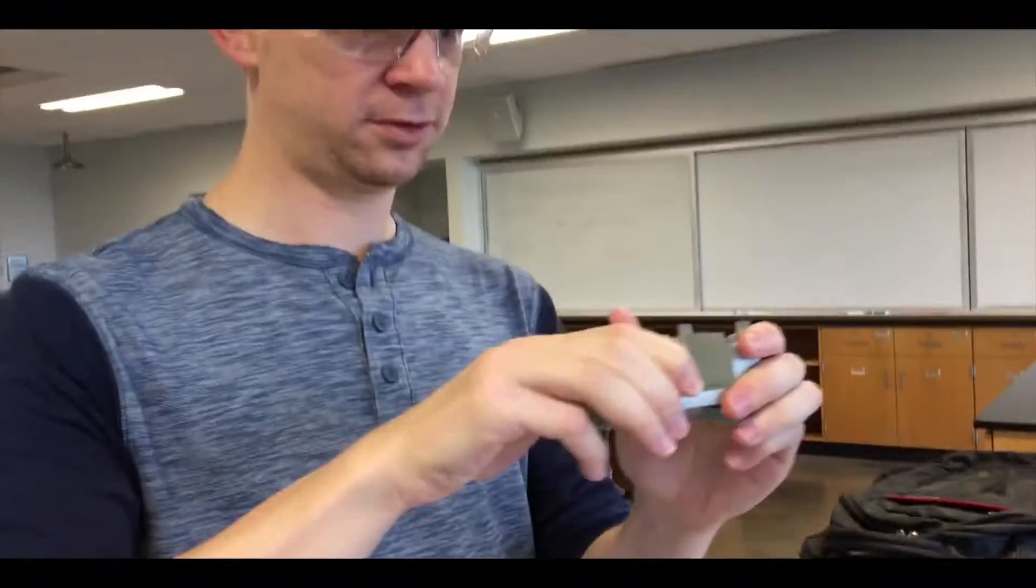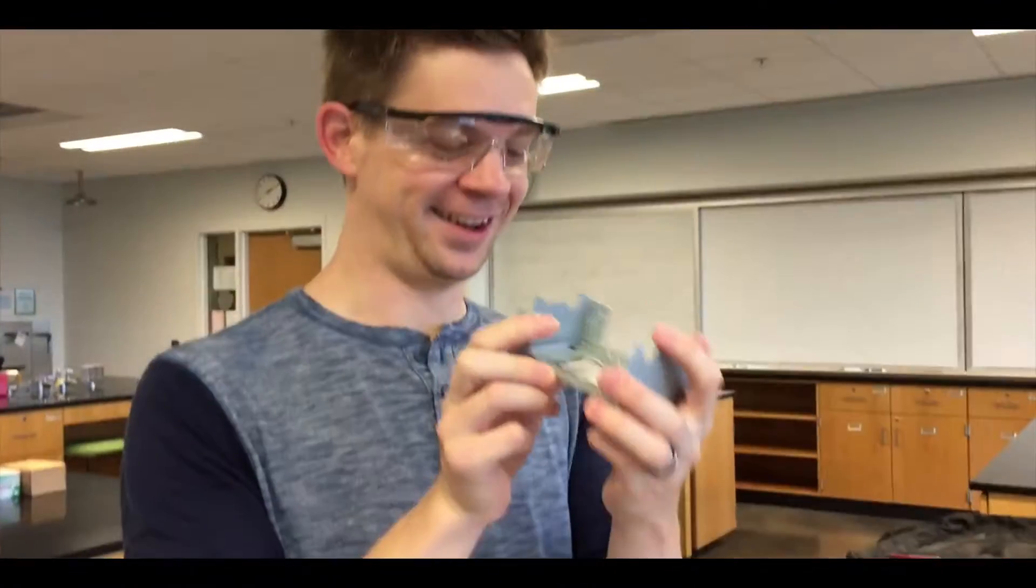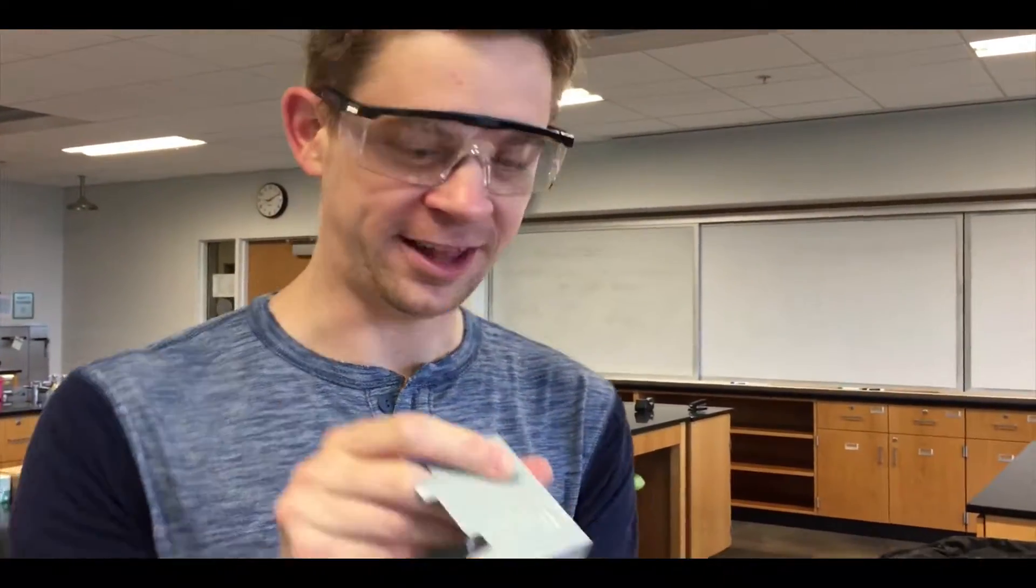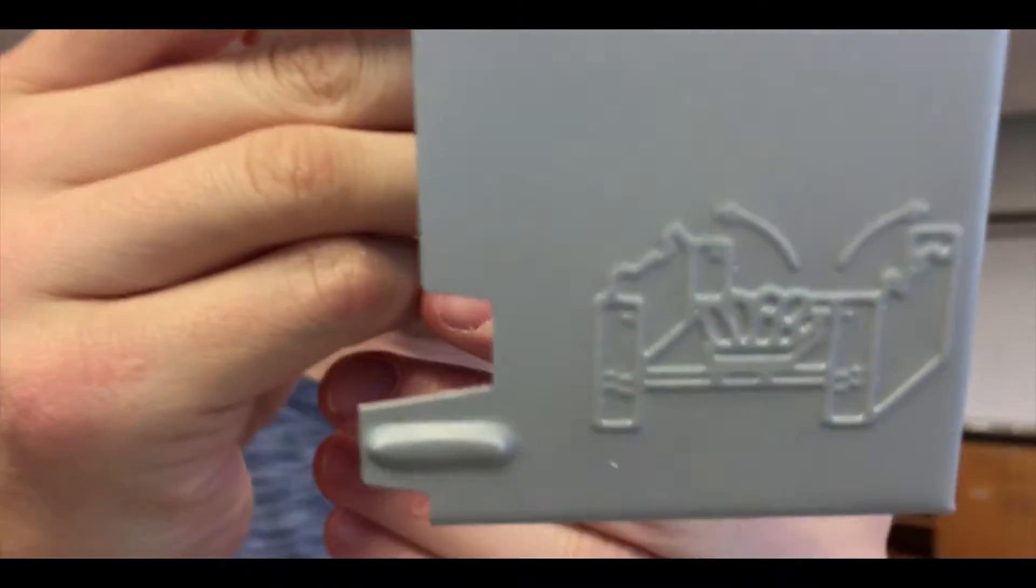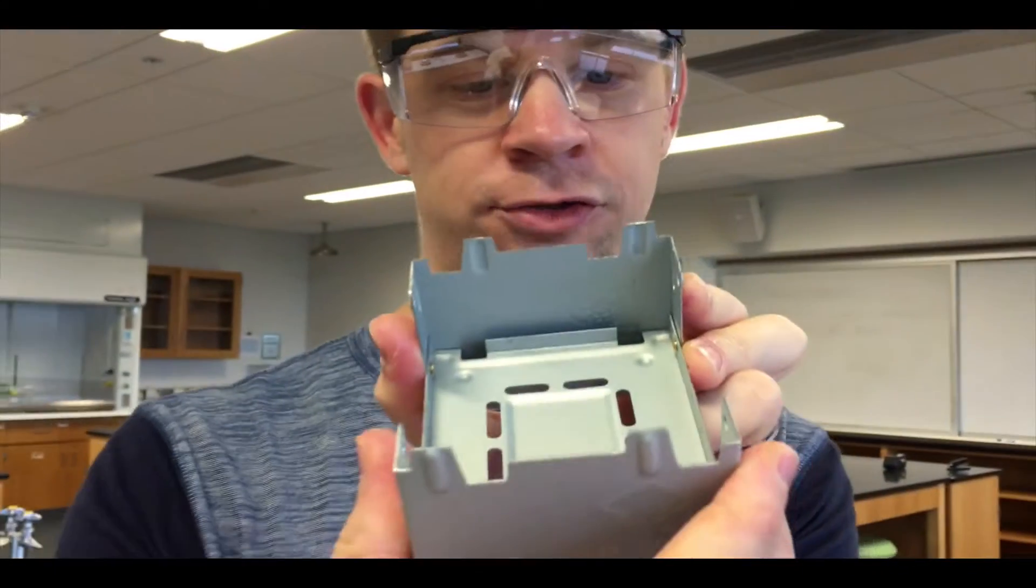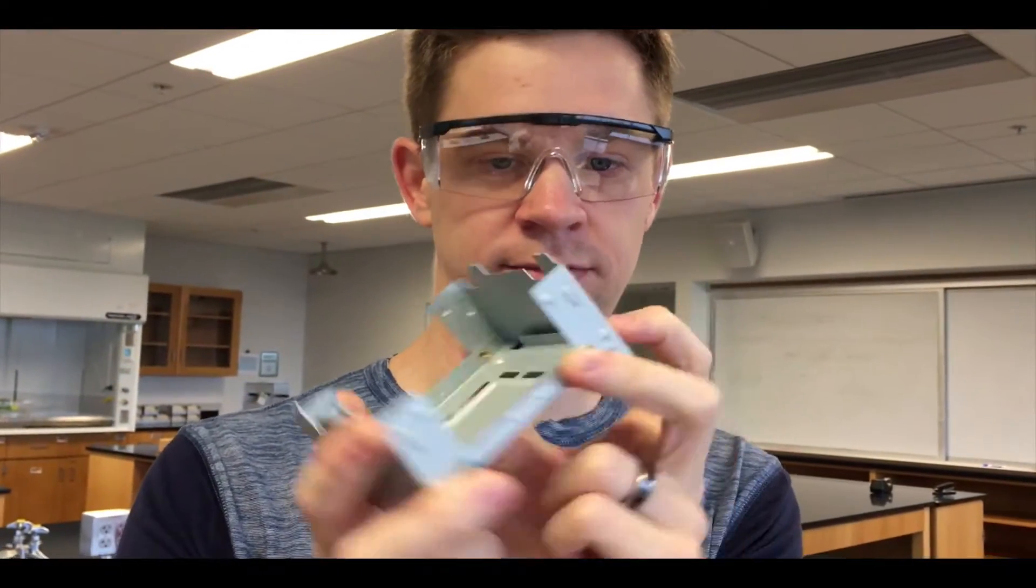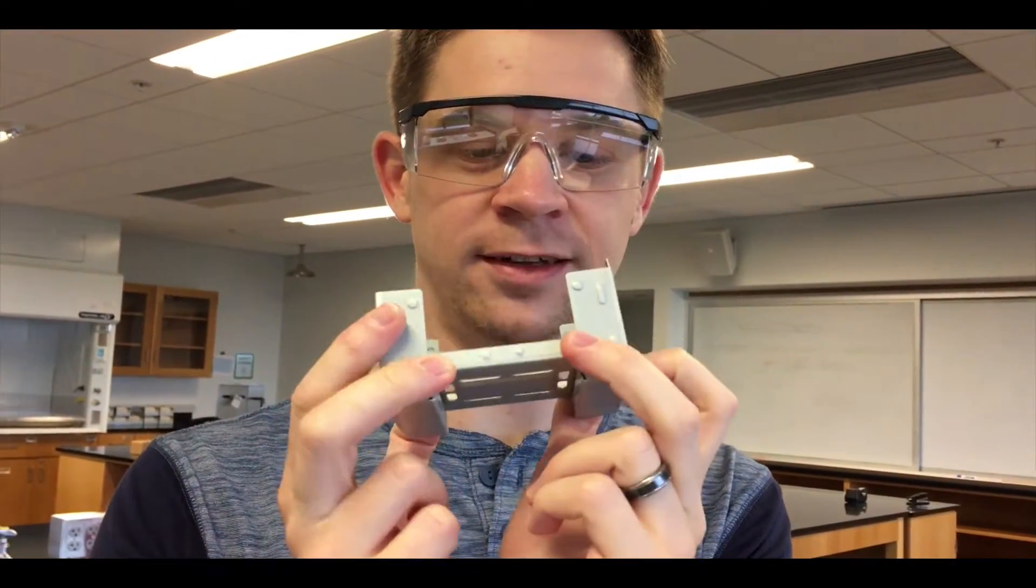And what is this? This looks like a hard drive. Whoa, it looks like a hard drive case with nothing in it. Okay, there's a little diagram of what you're supposed to do. It looks like you put french fries... it's a tray. Yeah, I think it's a tray for doing experiments or reactions that might get hot or something like that, but it's got holes in the bottom which is also a little weird.